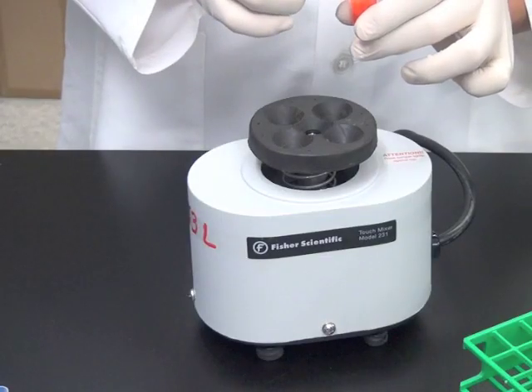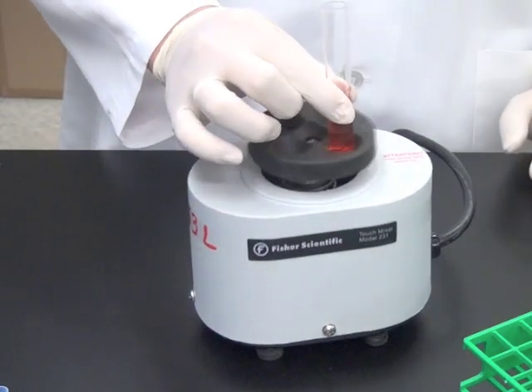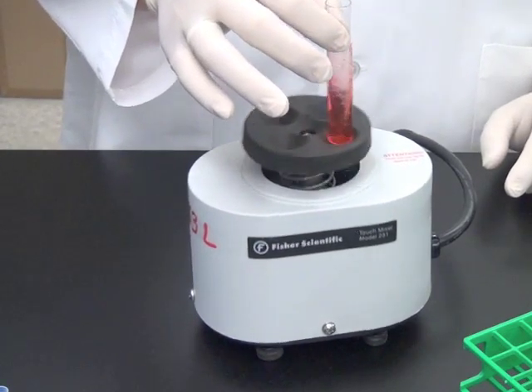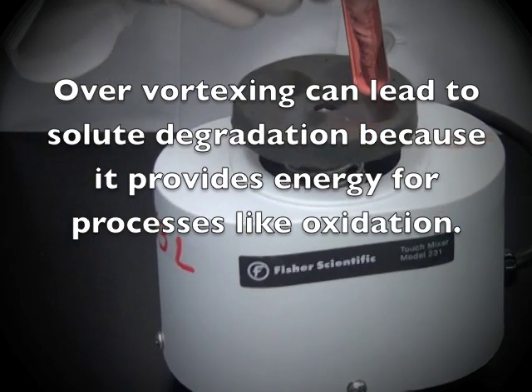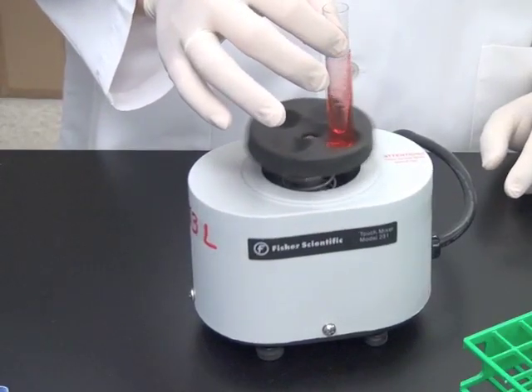Be sure your fingers are not placed too close to the solution, as they will dampen the force needed to agitate the solution completely. Also be sure not to over-vortex the solution, as too much mixing may cause the solutes to degrade. Once you have created a full vortex throughout the solution, you can stop.